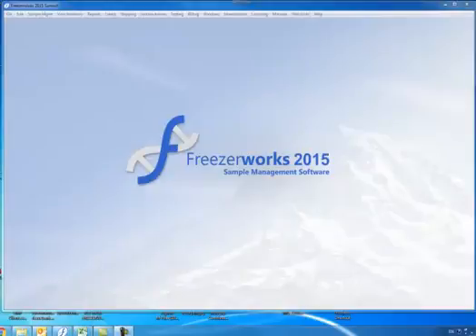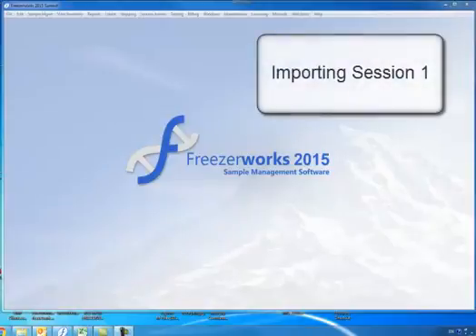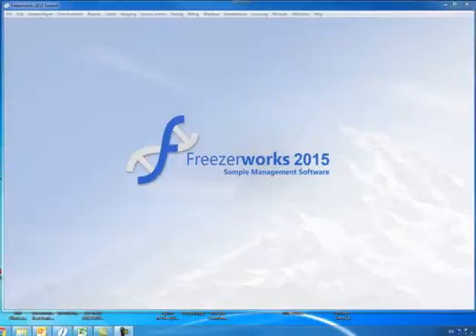Hello, and welcome to our first instruction on how to use the import option in Freezerworks 2015. I'm Rick Michaels, and this is an example of how you can use Freezerworks to import data from your Excel spreadsheet or a text file into Freezerworks.